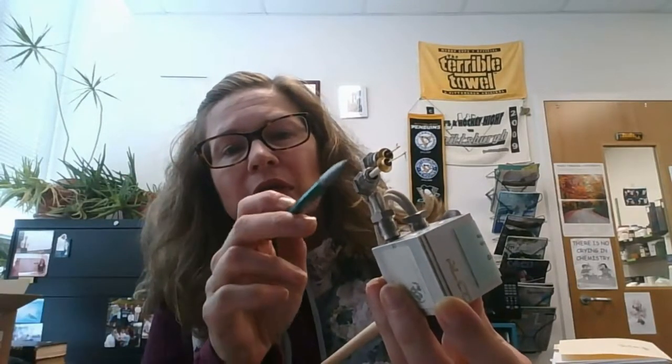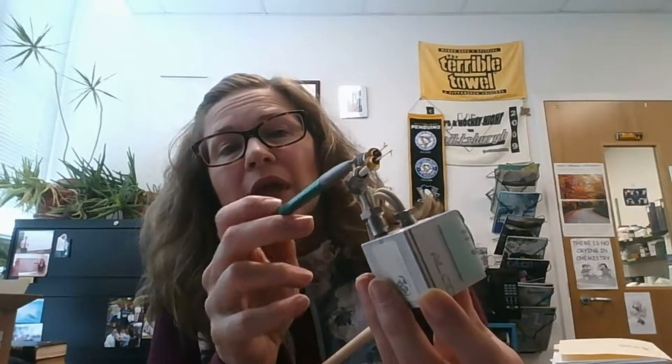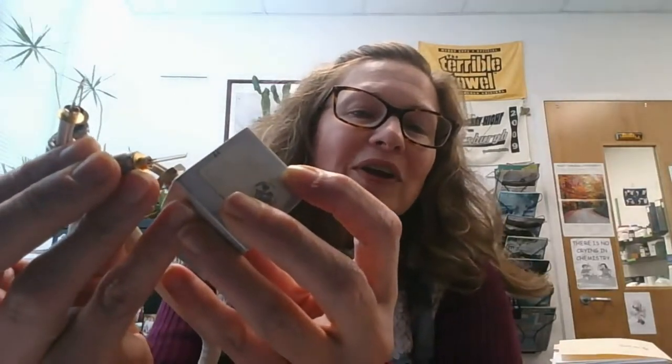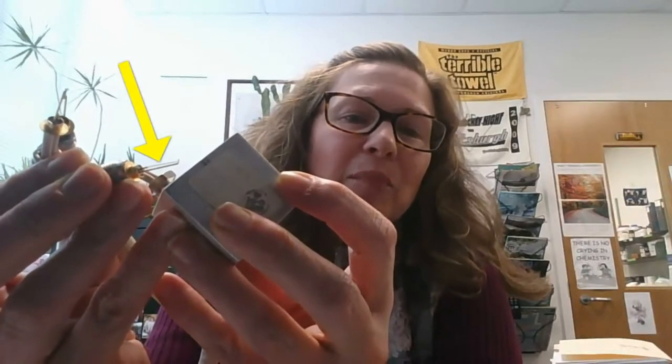If you look closely here, you can see that for these two filaments, the filament is actually broken. Can you make out that little piece of wire just dangling off there? That's actually a broken filament. There is one still intact here, and it's probably going to be hard for you to see it. Oh, there it is. The filament is that tiny thin wire above that golden wire. So that's a TCD. Back to the video.